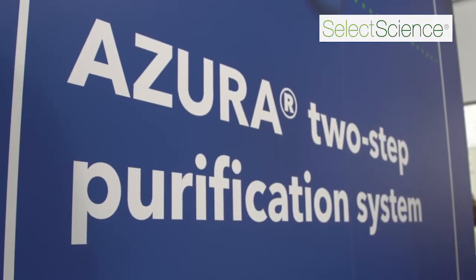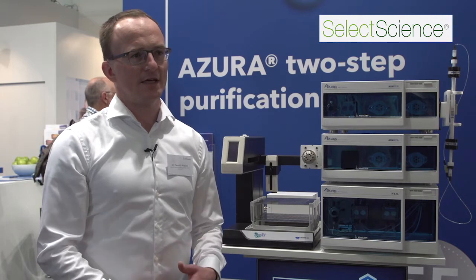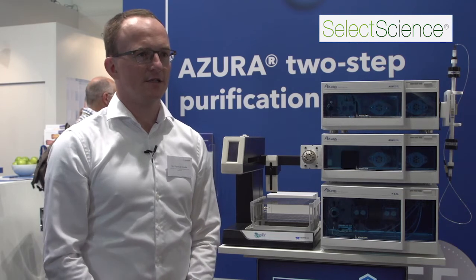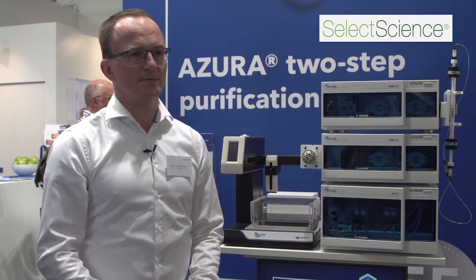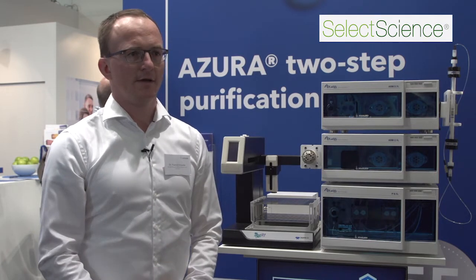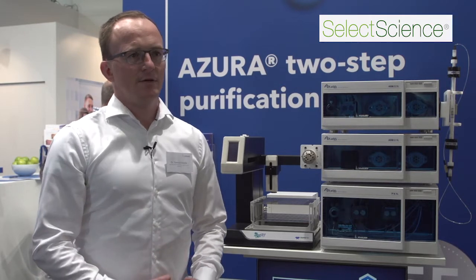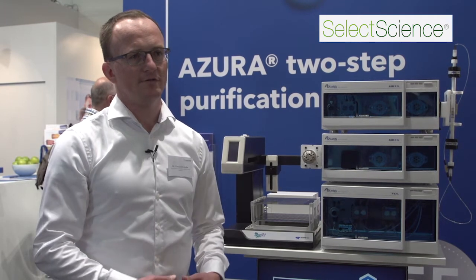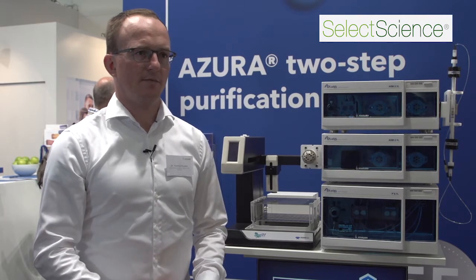The Azura BLC two-step purification system has the benefit that you can perform two protein purification steps one after another. Normally in protein purification you have a capture step and then one or two more steps to clean your protein. These two steps you can do with our system by using our column switching valve and our software, which enables automatization so you don't have to interact manually.